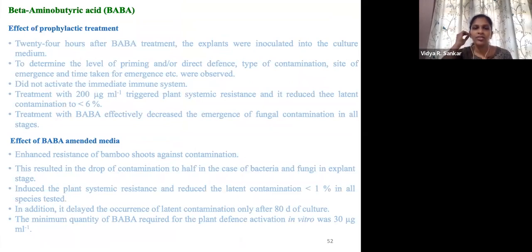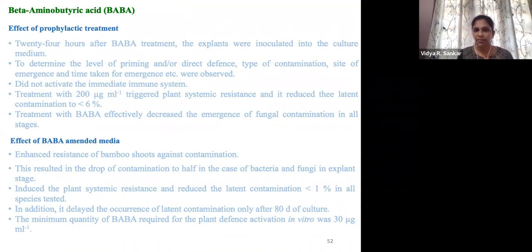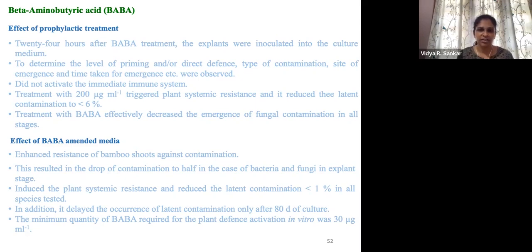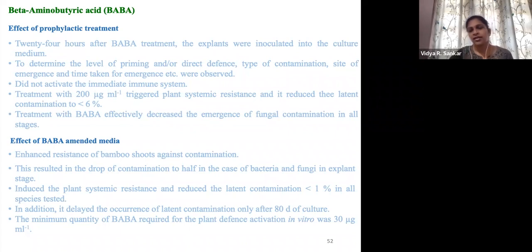Beta-aminobutyric acid was used for treatment in both ways: added to the media and treating the mother plant. The optimal concentration for treatment is 200 micrograms per ml, which reduced contamination to 6%. This is particularly working on fungal contamination, while the 6% mainly relates to bacterial contamination with no presence of any fungal contamination in most stages. For media amendment, we used a reduced concentration of 30 micrograms per ml, which totally reduced latent contamination up to 80 to 90 days of culture and reduced initial stage contamination to a level of 1%.